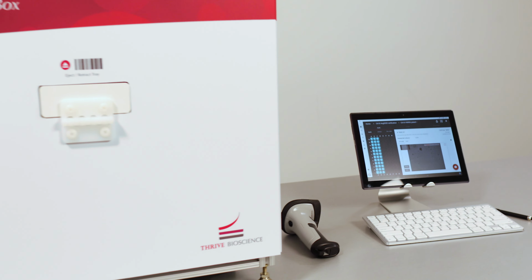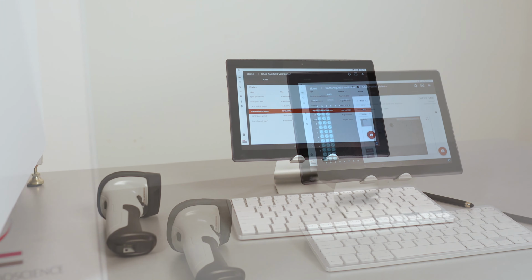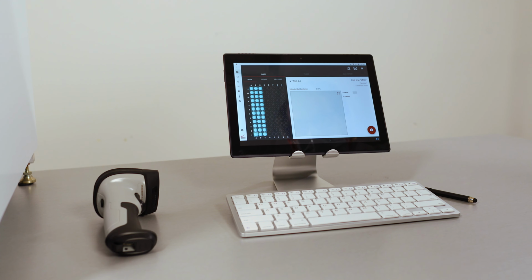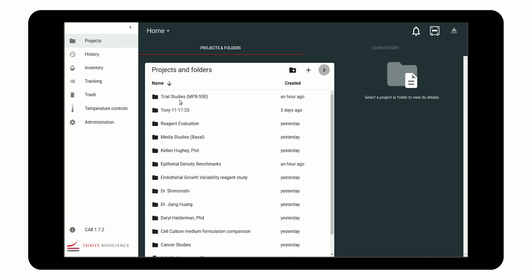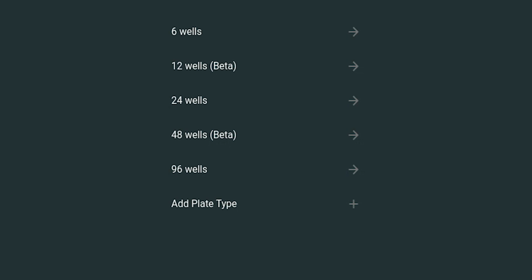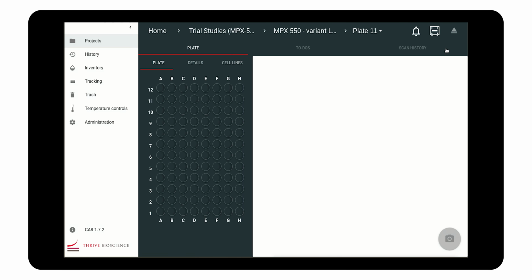When in the lab, you typically operate the CellAssist instrument using the supplied tablet with CellAssist software. You define plates and cell lines for your experiments, apply conditions, and control the imaging functions of CellAssist. On the tablet, your work is saved in a standard file structure by file name and folder. You simply select the type of plate you want, and add the cell lines.